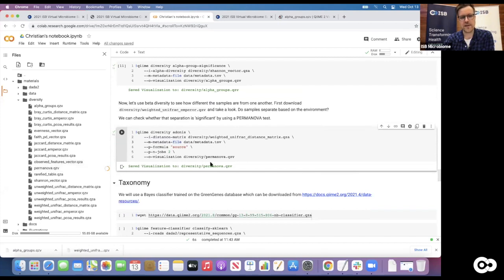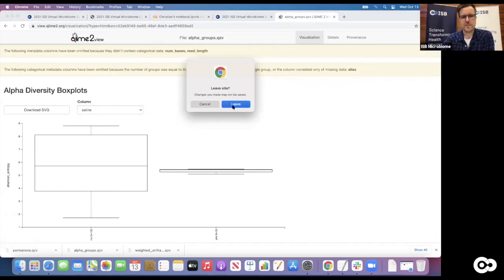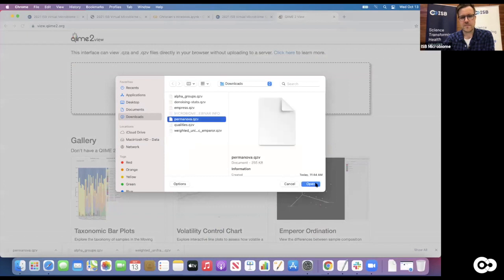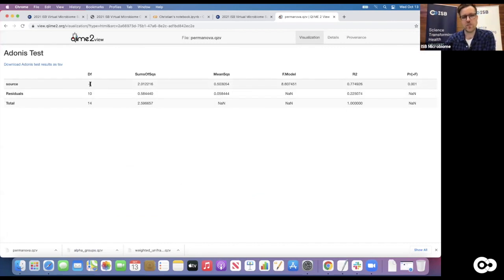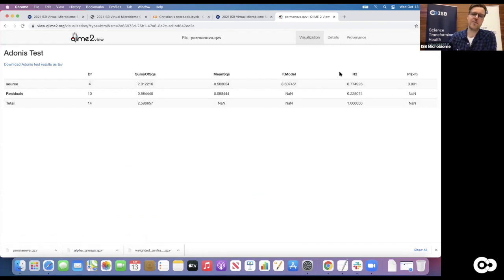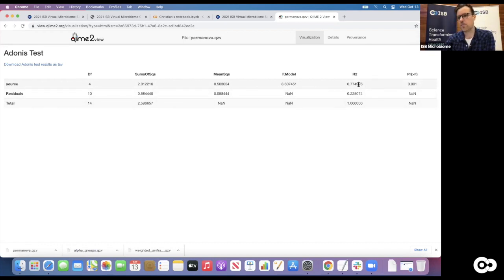After generating the PERMANOVA output, we download and view the visualization in the online portal. It gives us a summary of the tests that were run. The 'source' has four degrees of freedom because degrees of freedom is one less than the actual number of groups, and we have five different groups. We also get the F value and the R-squared, which is the fraction of explained variance. Here we actually explain 77 percent of the entire variance in the distance matrix with that one variable - the source - which is a pretty high fraction.